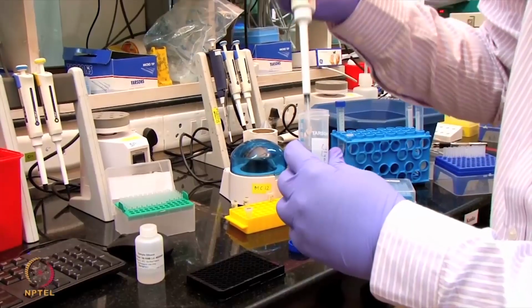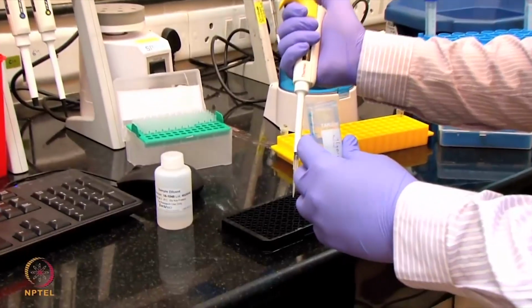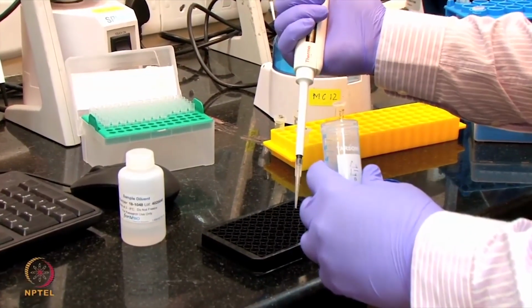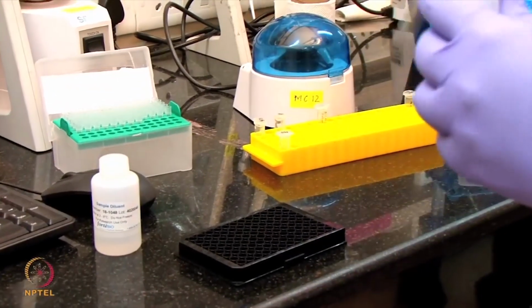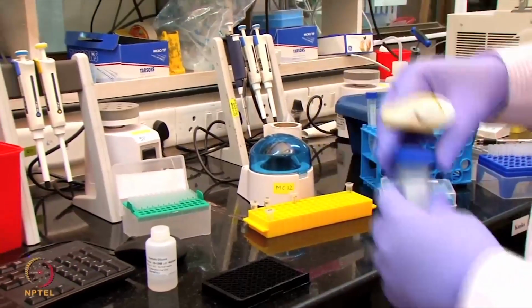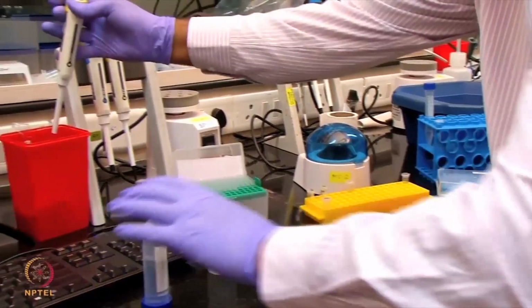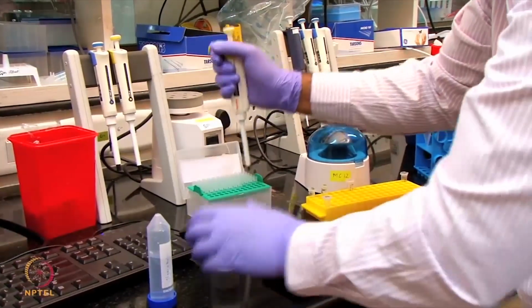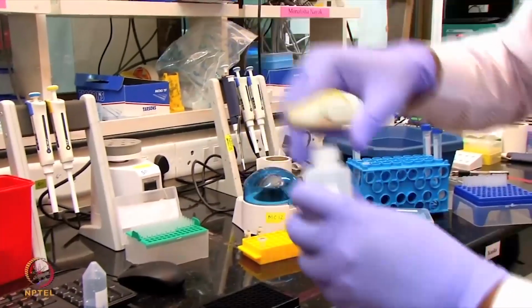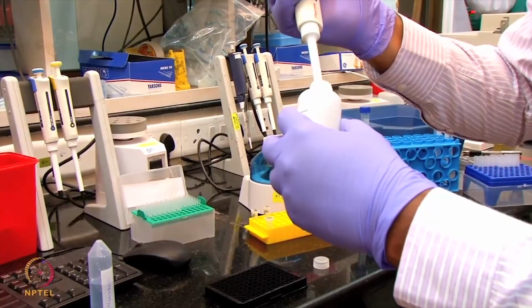So the regeneration buffer I'm going to place at A11 and B11. The bound apolipoprotein will be washed off when the sensor dips into this acidic buffer. Also we have to place one more, which we call a neutral buffer, that is this PBST buffer. I'm going to place this one at A12 and B12.